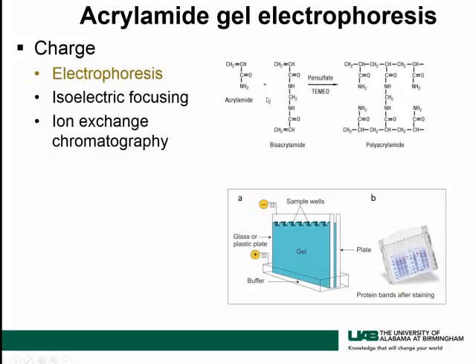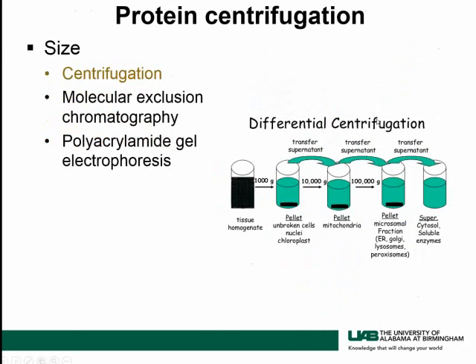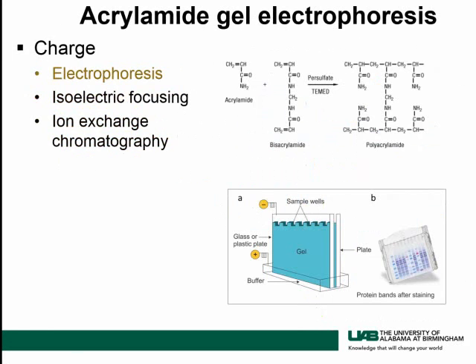Okay, and so you go from individual molecules to a polymer right here that can be made into a gel like a jello right here.